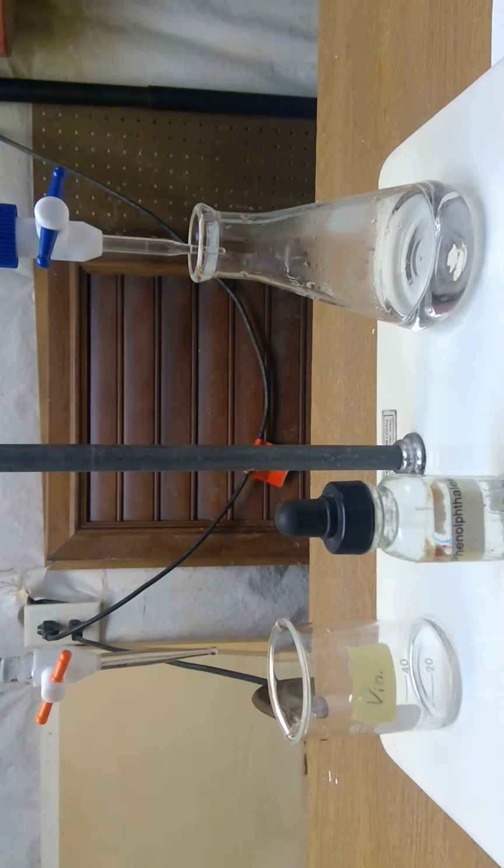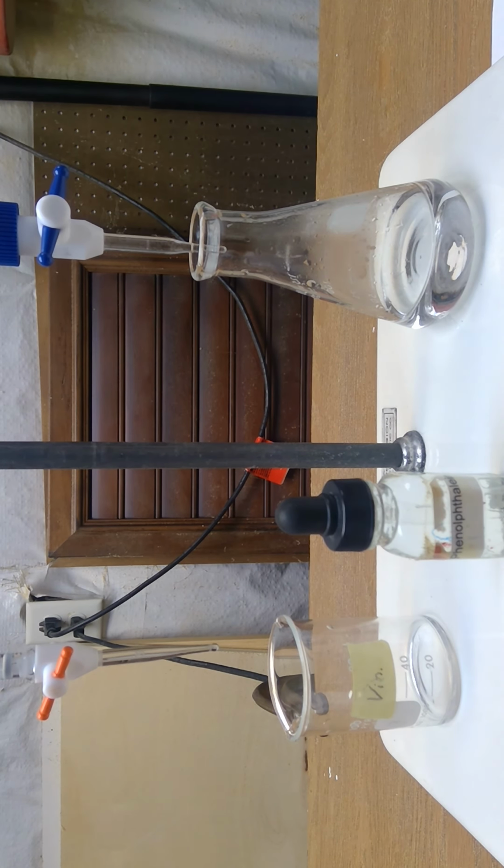Okay. All right, so that's our titration lab. All right, you have a bunch of calculations to do, so eventually you're going to be able to tell me all about this white vinegar.